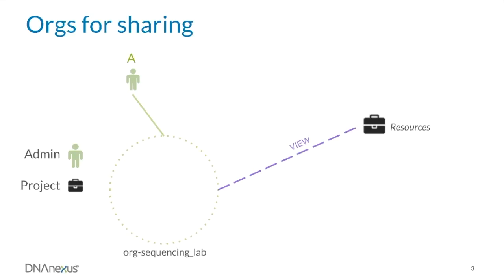We can give Org Sequencing Lab view permissions to a project called Resources. By sharing this project with the org, we are giving every member of Org Sequencing Lab view permissions to this project. Right now the org only has one member, user A, which means only user A has permissions to the Resources project via the permissions granted to his org.